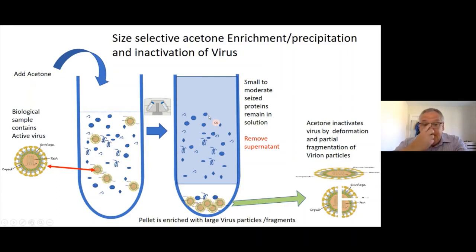Now, there's another major advantage of using acetone as a precipitant is that it actually deactivates your virus.